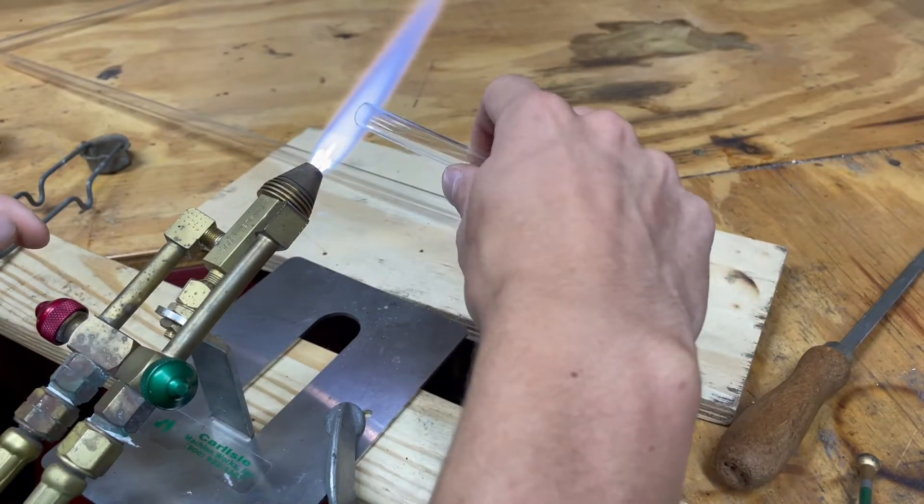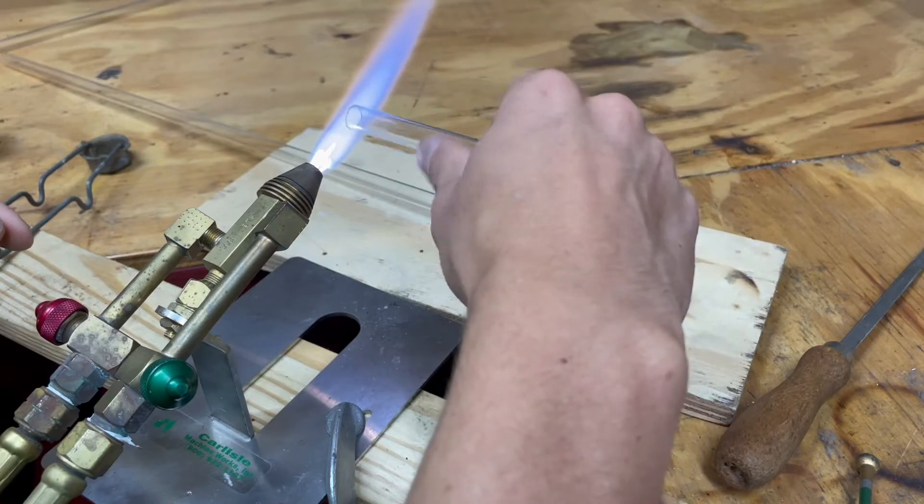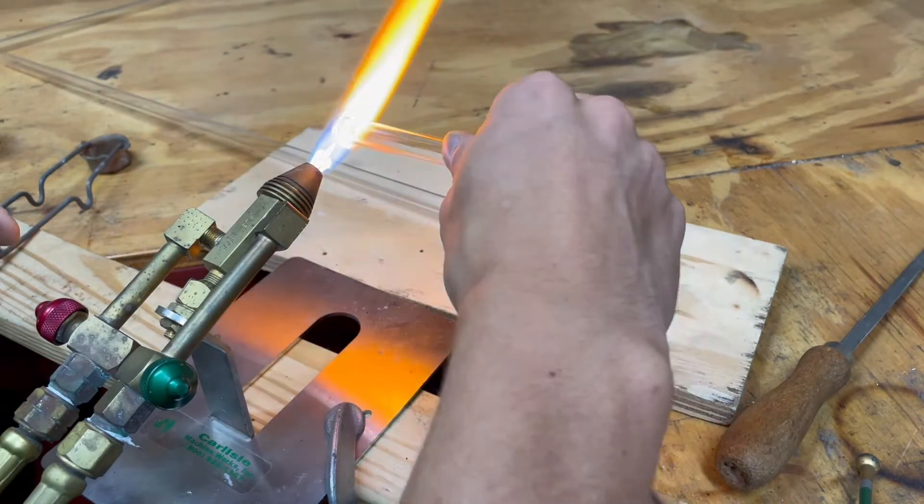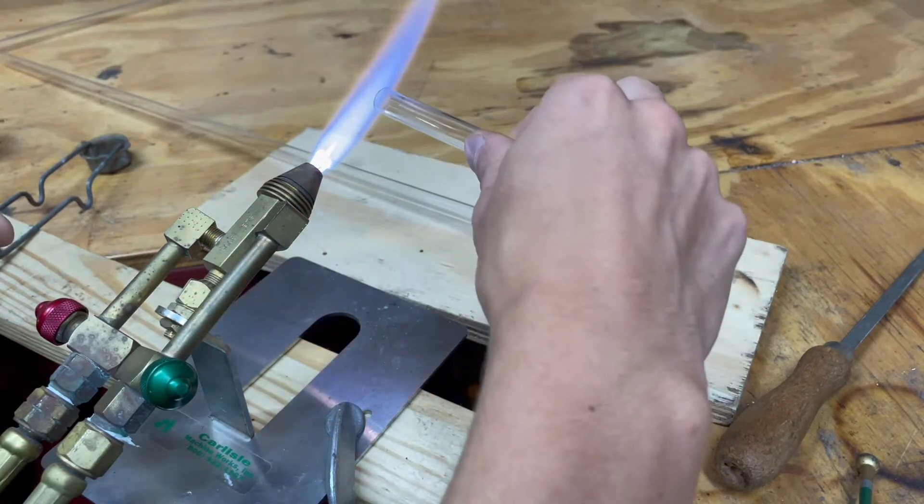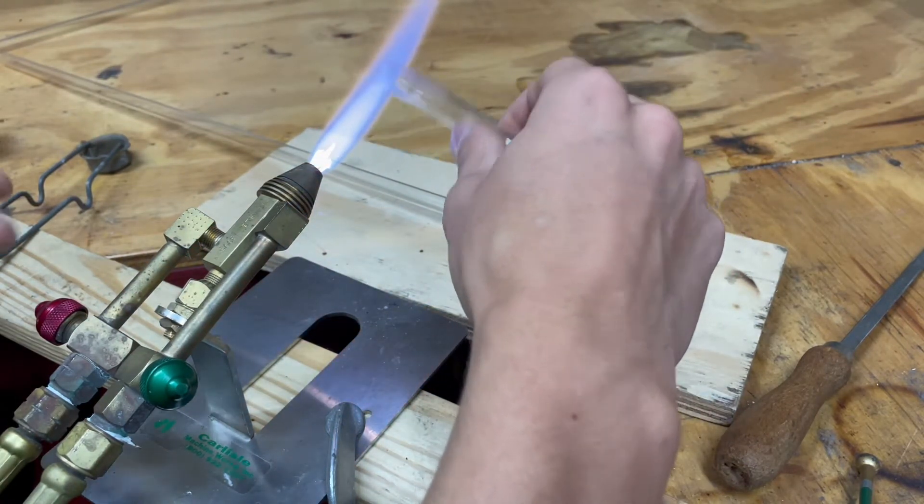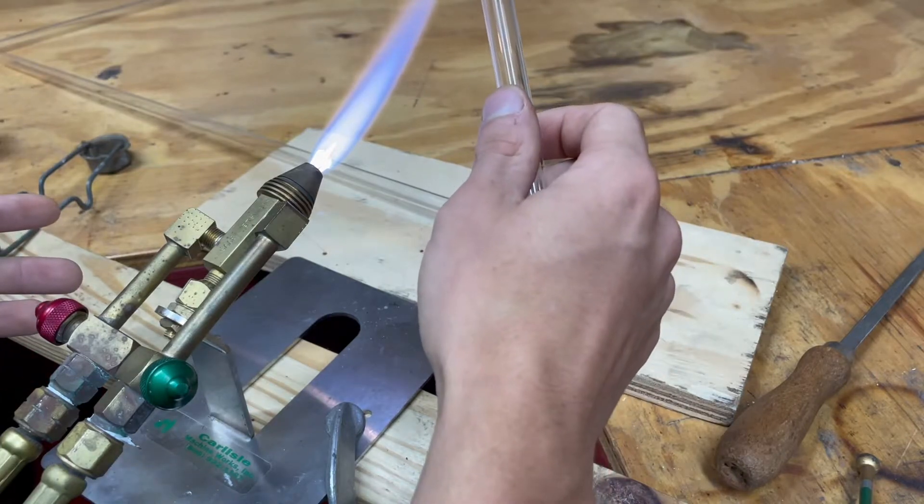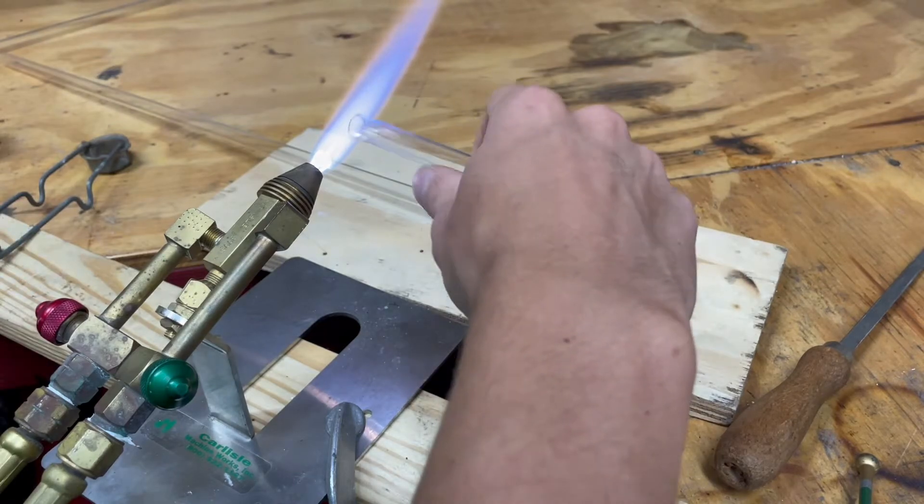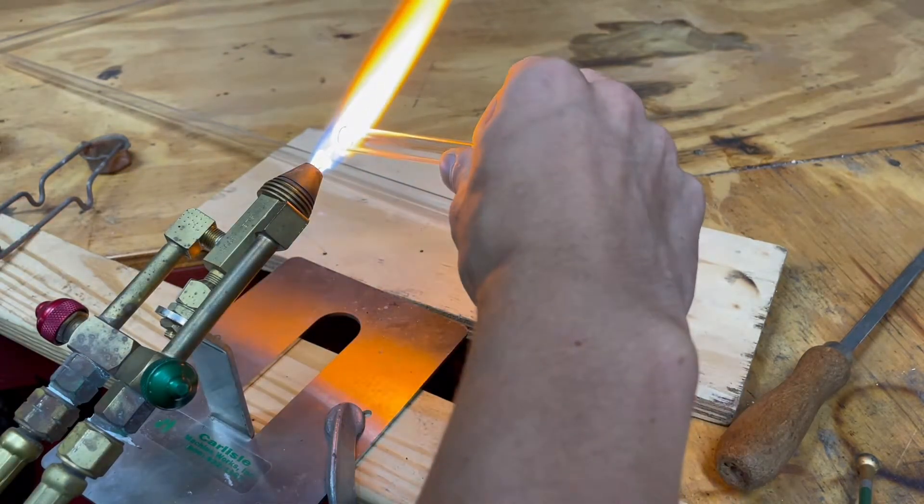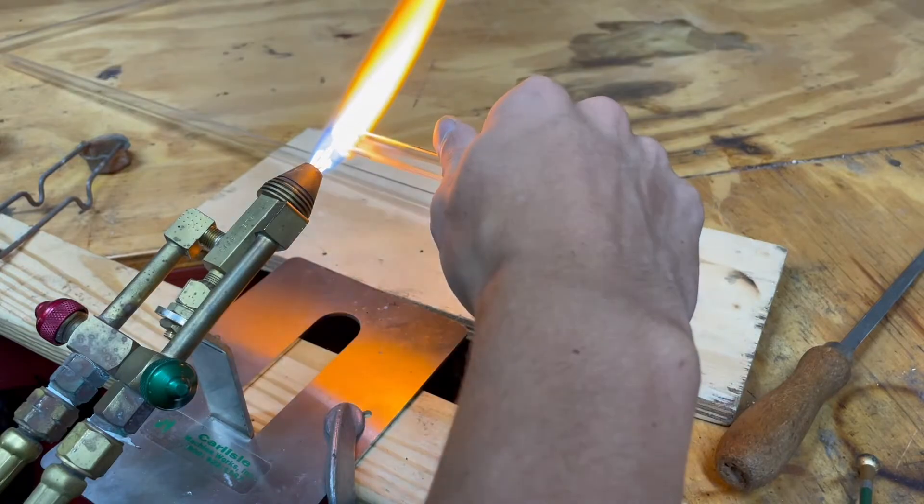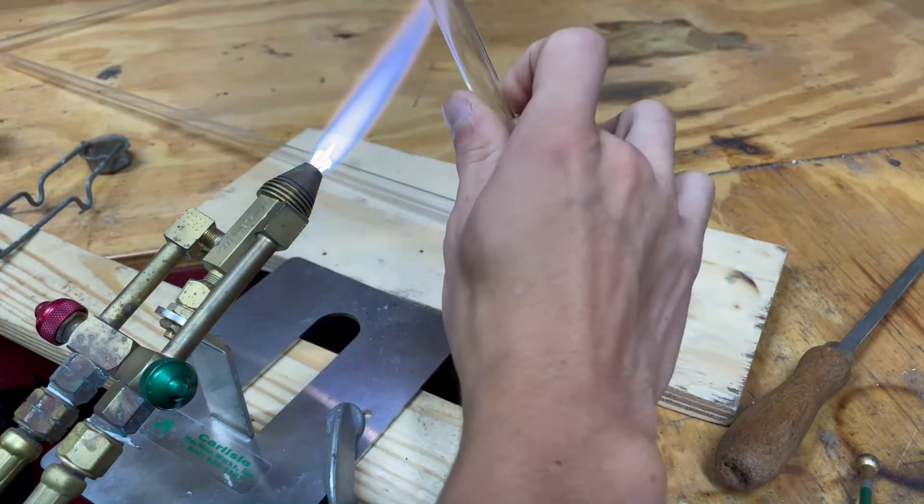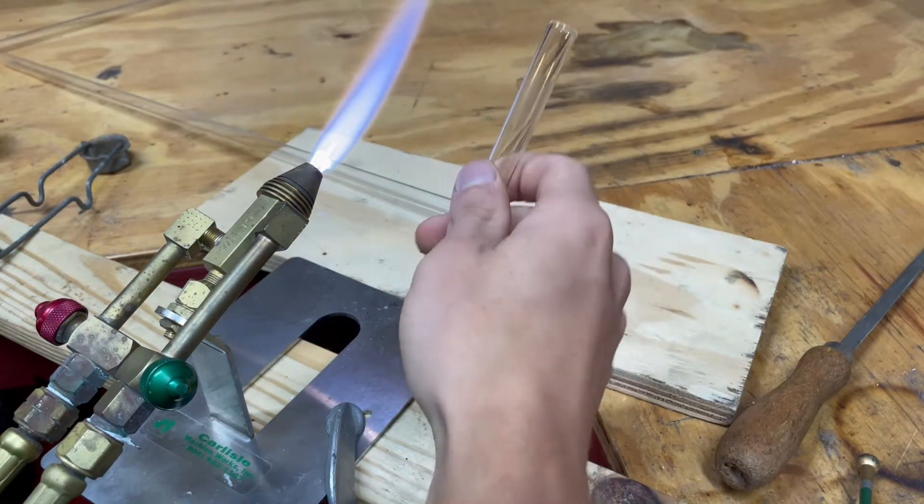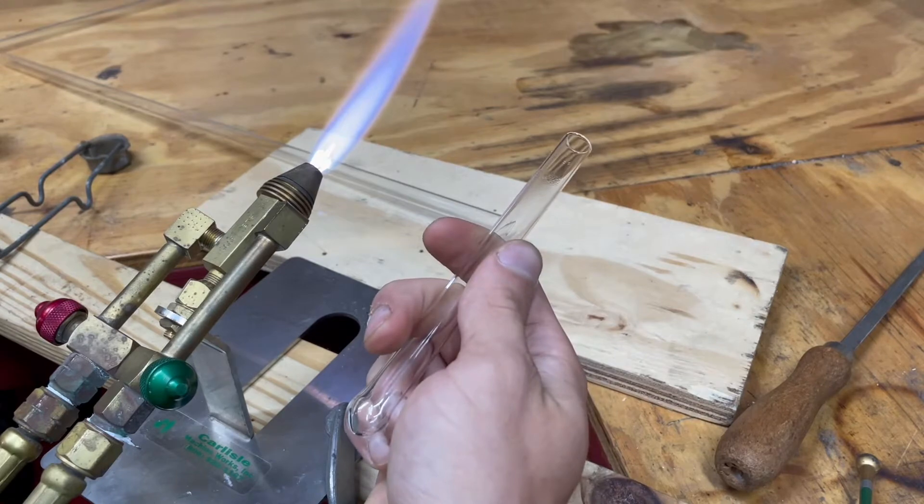Now we're going to bring it in and start heating it slowly at first until we get to the point where we start seeing the sodium flares and it starts melting. Once again it's not as common with rod as tubing for it to break as soon as you go into it but it can occur. Now it really doesn't take much to flame polish and we're already done.